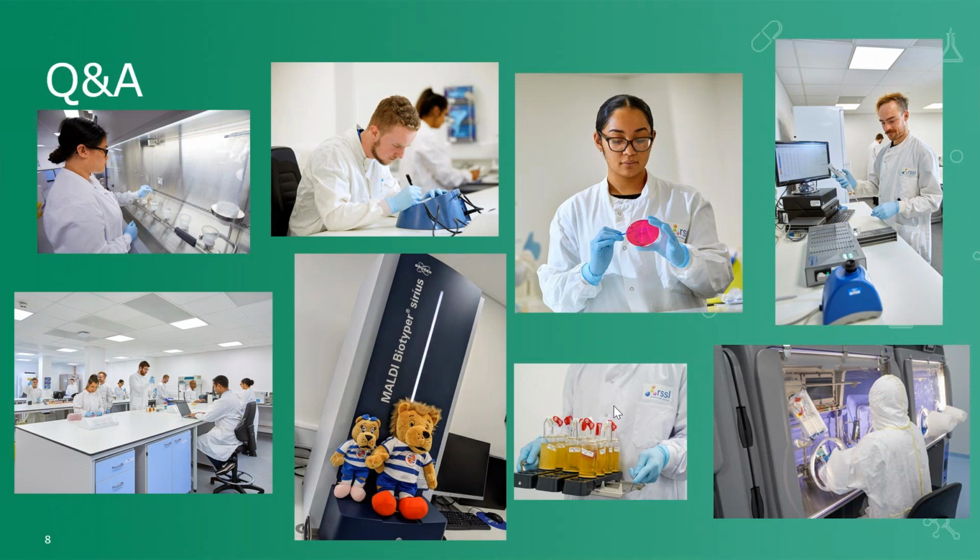Okay, and I have a question from Adeyemi, and they've said, can the PCR method be classified as a microbial ID rapid method? Well, for Mycoplasma, you'll find out, as long as it can detect the species that you're interested in.